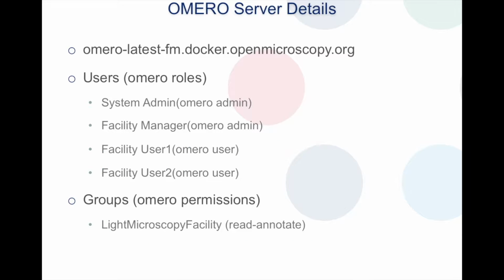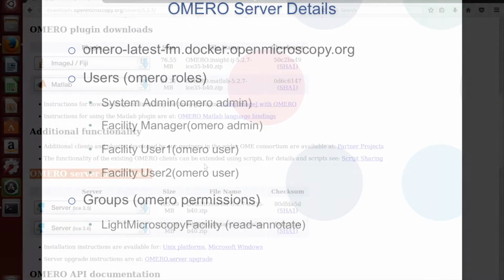And for this demonstration, I'll be using an OMERO server, and the details of this server are highlighted on this slide. Now let's look at the workflow, and before getting into the workflow, let's look at the downloads pages first.